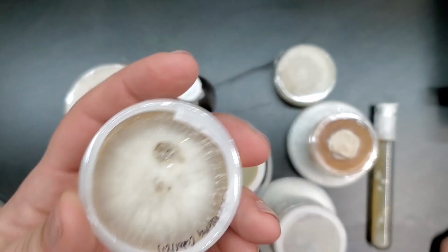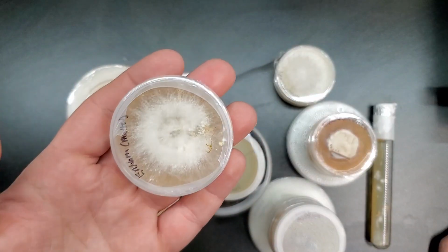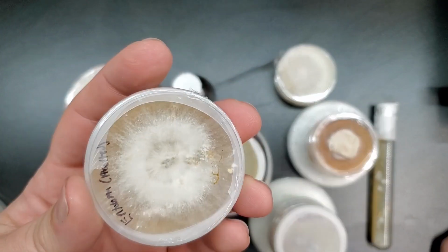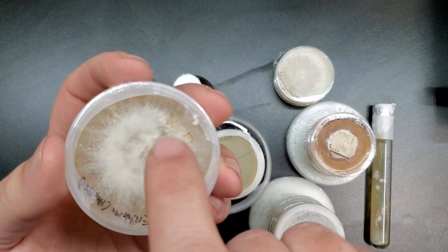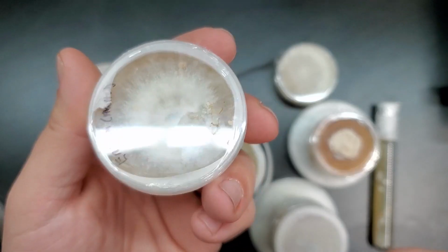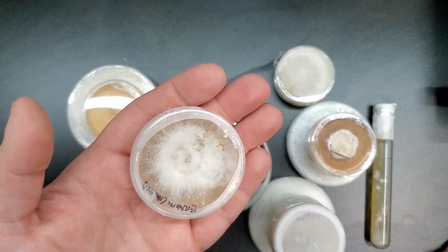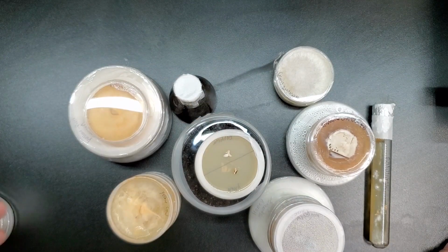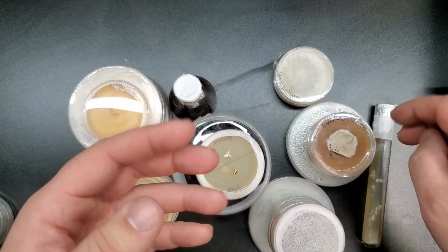And this isn't a one-off. Here is another one. Again, this is another one of the original ones that I inoculated straight with the mushroom tissue. I don't know if you can see all that great because of the condensation on the top here, but there is another nodule on this guy that looks like an aborted form of the Entoloma abortivum. So that is really, really cool. But there's something even cooler, I think at least, to talk about here.